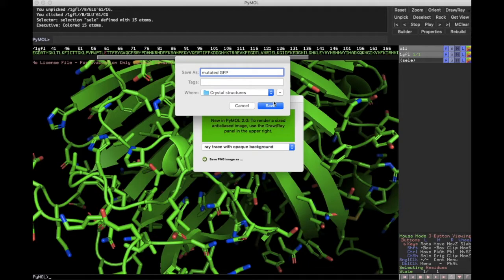In this case, often the way you label mutated proteins is, so you can see up here, this is amino acid 61, all right? So what you would typically do is you do it like this. So we started out with a valine.